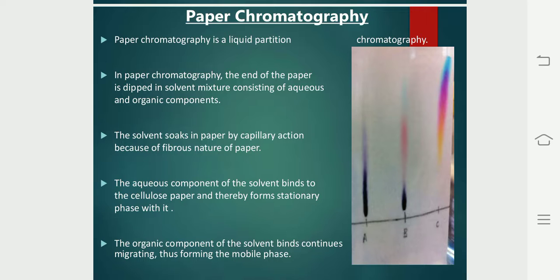The separation is based on the solubility of these samples in the mobile phase, or their affinity or interaction between the stationary phase and the mobile phase.